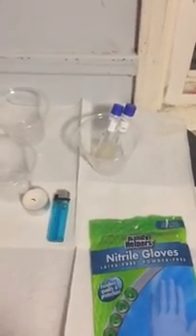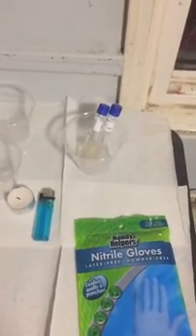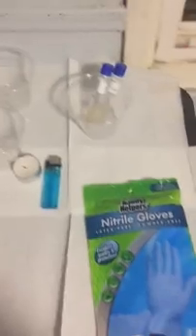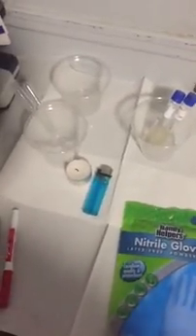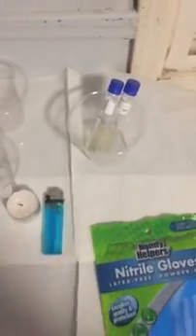This is Maria again for microbiology experiment on environmental influences on microbial growth using salt tolerance testing and pH testing. For our experiment, of course, we do need to prep our table. We need to wipe it with the Clorox. I use Clorox wipes, and then I put paper towel over my table to lessen contamination.